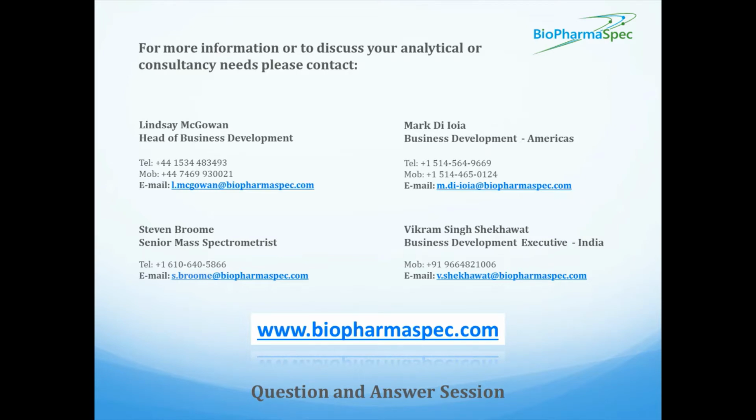And that's where, instead of focusing on impurities, or process-related impurities like we talked about today, you're focusing on the product itself. There's a series of tests that you can use to do that, and BioPharmaSpec actually does a lot of this testing. There's different mass spec assays where you can do peptide mapping or intact mass analysis. SEC-MALS and SV-AUC are two examples of tests that aren't mass spec based that we use to test for aggregation.